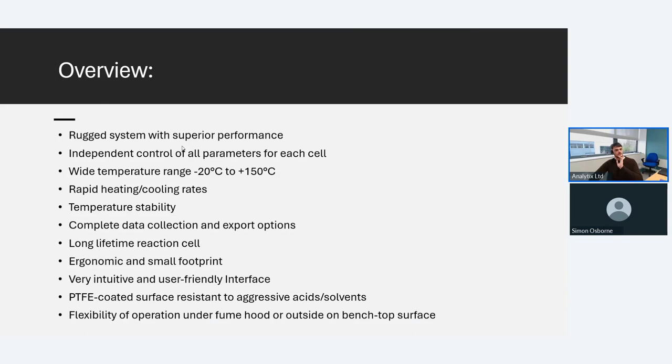I wanted to use this point to give an overview of the hardware and software. Excelsis is a really rugged system with superior performance. We have independent control in all cells for temperature and stirring. We can reach a wide range of temperature minus 20 to 150, and we have rapid heating and cooling rates and exceptional temperature stability. We have complete data collection methods and we're able to export these really easily. The reaction cell itself has a really long lifetime. It's ergonomic and has a small footprint within or outside of your fume cupboard. We have a really intuitive and user-friendly interface, with options of using within the fume cupboard stacked or separate or outside of the fume cupboard.